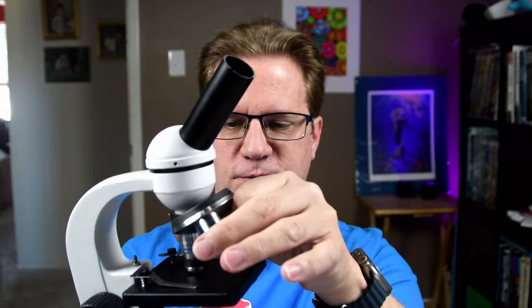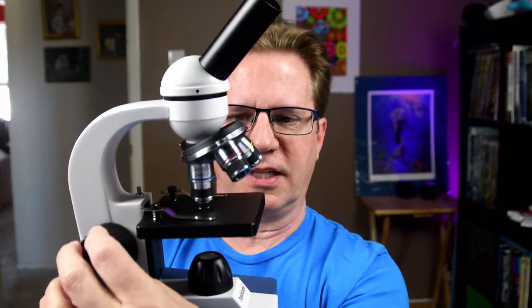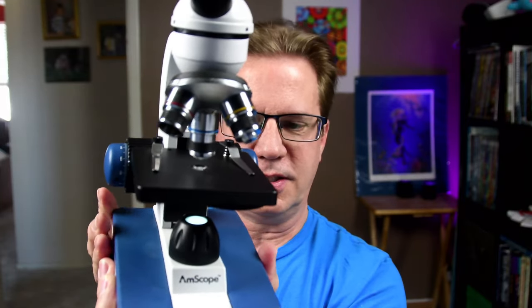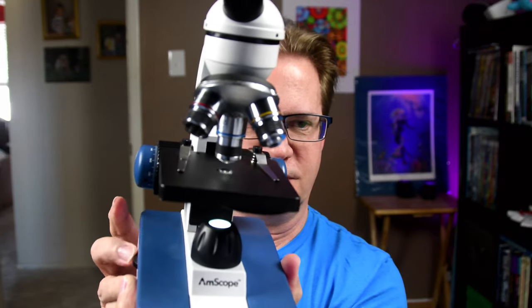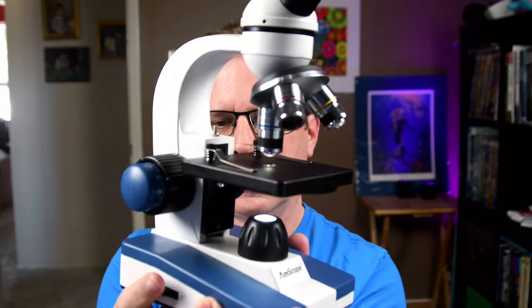You've got these different heights — you bring it up and down to find that sweet spot and it's pretty easy to use. Down here is a light, and you can increase the brightness or dim it down with this knob on the side. Overall, not bad, and this was about $102, so it wasn't a huge investment. I've been on the fence about buying one for a long time, wanting something I could connect to my phone or computer, but this one doesn't do that — it allows me to look at what's on the substrate of my sand, and that's what matters most.